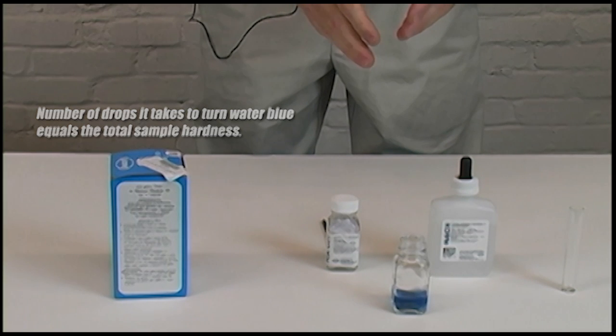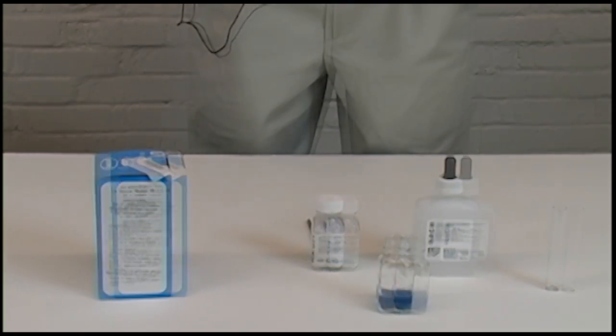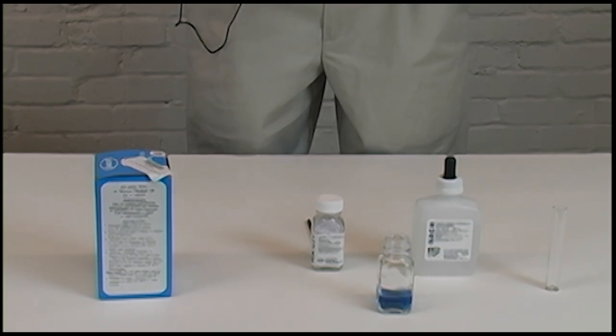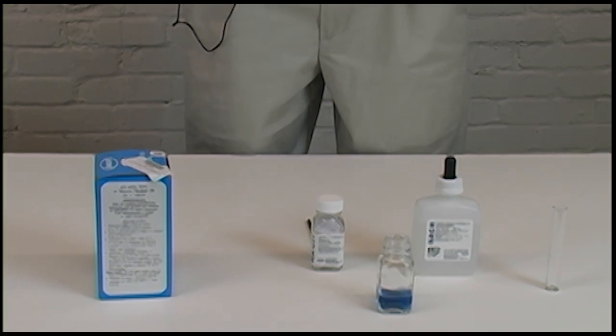It took us seven drops for this to turn to the blue color, and basically seven drops means seven grains of hardness — every drop counts as one grain. This gives you an idea of where you're at with your water quality and also how much you're wasting on your soaps to try to get to the level of foam and cleaning that you're looking for.